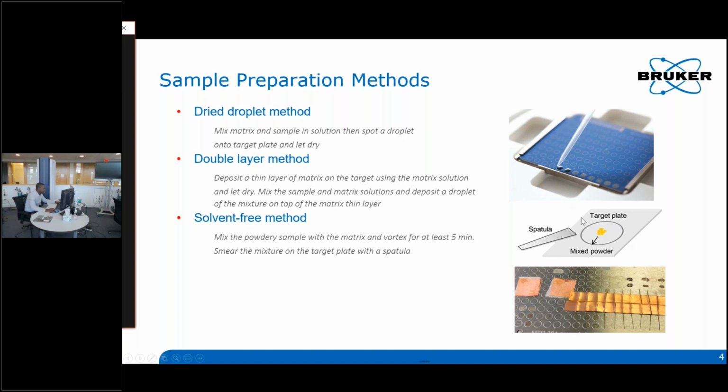And this is a nice image just to show how that's done. So you don't really need to have your sample soluble in anything, as compared to most other techniques, to be able to analyze it by MALDI.